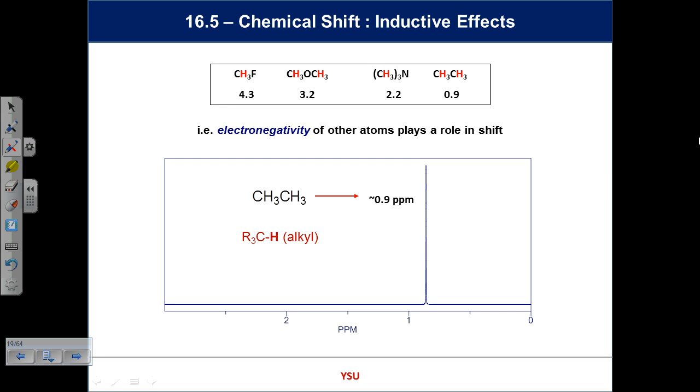Now, to get this started, we're going to talk about very simple spectra with only one signal. And then we'll build it up. By the end of today, we should be into multiple signals, and we should be into multiplets, talking about where the things show and also maybe what shape they should be. I have here a very simple molecule, ethane. At the top here, I have an idea of where ethane shows. The CH3 groups are the same. They should have one signal. And there's no splitting in this for a reason that will become apparent in a second.